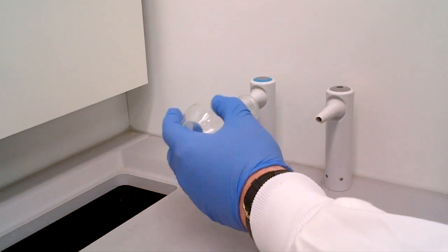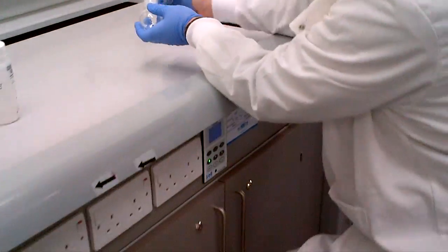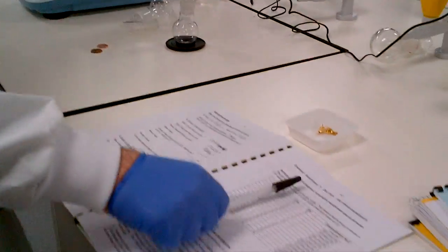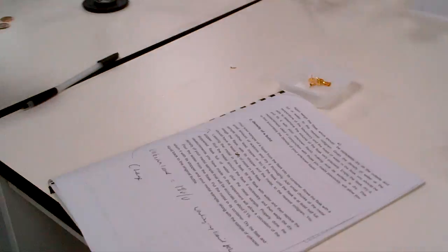Rotate around. A minute, that's done. Tap off, the stopper's dry. So then, go back towards the balance area. And the next part of the practical is asking you to find the density of an unknown solid.